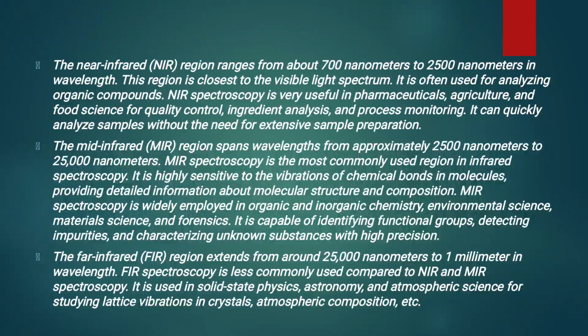It is often used for analyzing organic compounds. NIR spectroscopy is very useful in pharmaceuticals, agriculture, and food science for quality control, ingredient analysis, and process monitoring. It can quickly analyze samples without the need for extensive sample preparation.